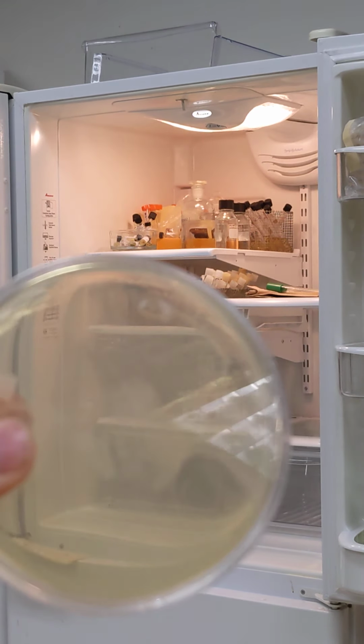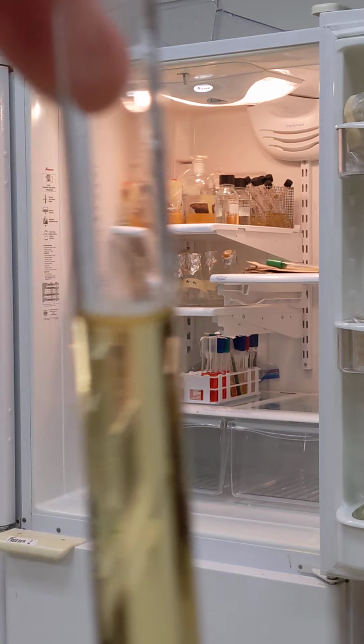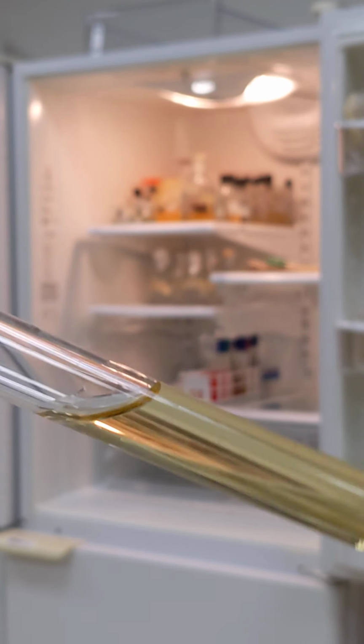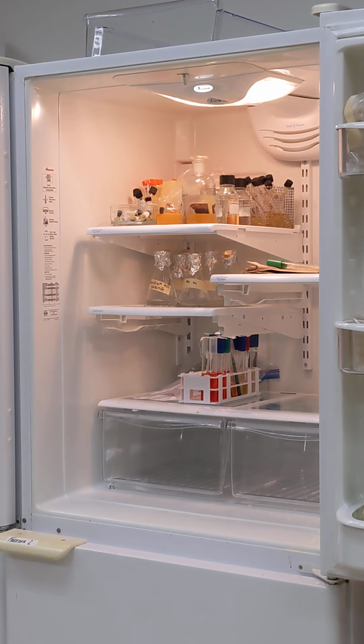So a deep is pretty much exactly what it sounds like. We have a whole bunch of this agar. Here, this is a tryptic soy agar. Sorry, it's a little blurry. And this is solid, so I can flip it around. Nothing's going to happen. In contrast, another one that we sometimes use are what are called broths. Broths are going to be when we want to grow things in a liquid suspension. So liquid, there's no agar that's being used to solidify that.